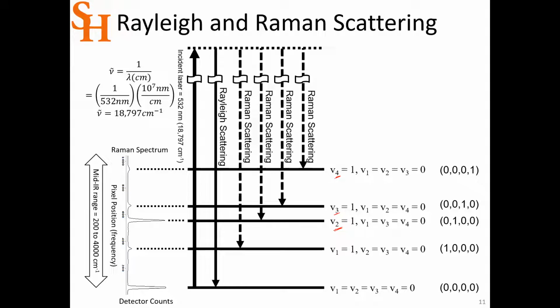In this week's lab, I talk a lot about Herzberg. Gerhard Herzberg in the early 1900s was one of the scientists who analyzed small molecular spectra. This was the days when they used photographic film. And so instead of a detector, they would have a dispersing element like a grating, and they would just expose film. And you would see dark lines of exposed light wherever these Raman peaks showed up. And so that's where they got called lines, because they were lines on a photographic plate.